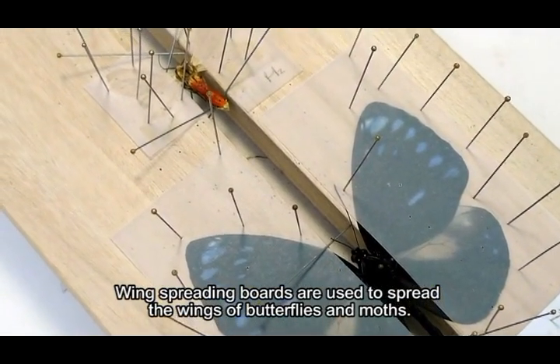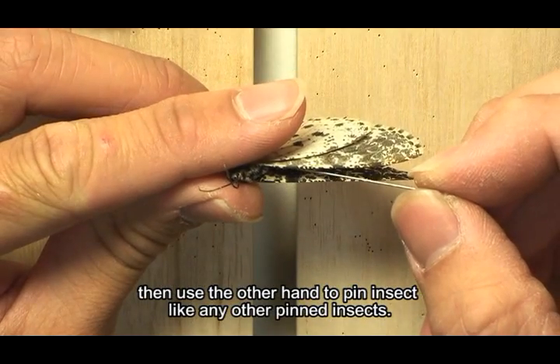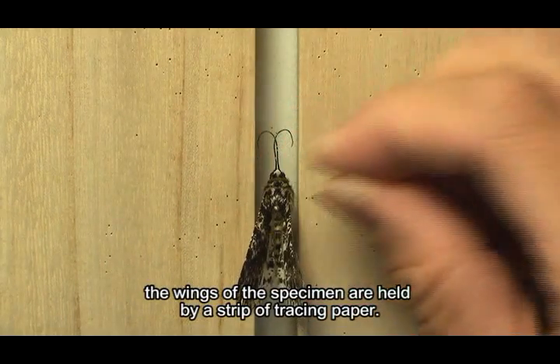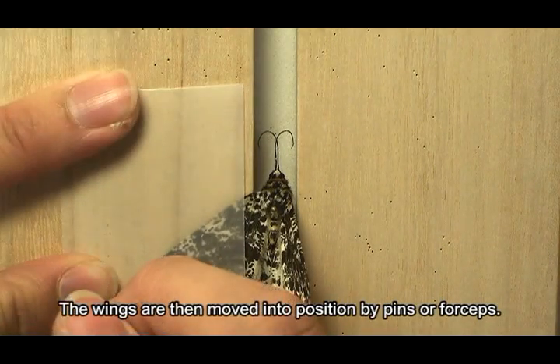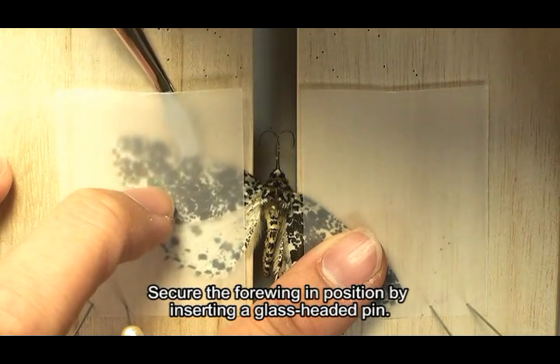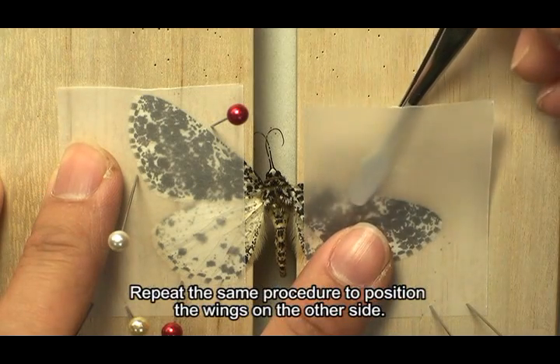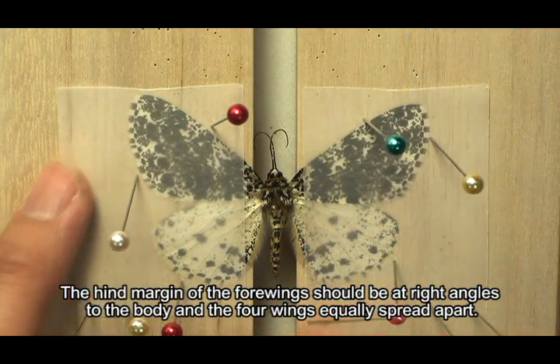Wing spreading boards are used to spread the wings of butterflies and moths. Hold the thorax with your thumb and index finger, then pin the insect and insert the pin into the groove of the wing spreading board until the wings are flush with the surface. The wings are held by a strip of tracing paper, then moved into position by pins or forceps. Pull the forewing forward until the hind margin is at a right angle to the body, and secure with a glass-headed pin. Bring the hind wing into position with its base slightly under the forewing and secure it. Repeat the same procedure for the other side. The hind margin of the forewings should be at right angles to the body and the forewings equally spread apart.